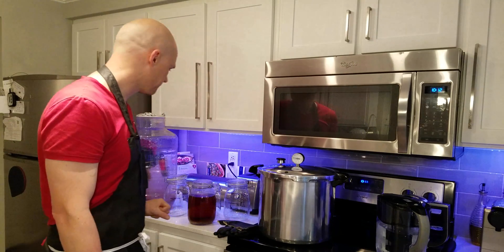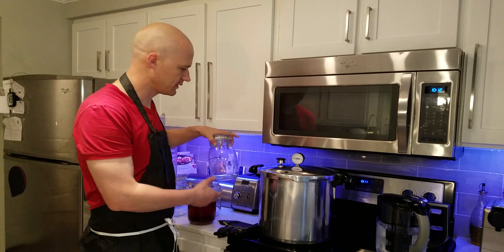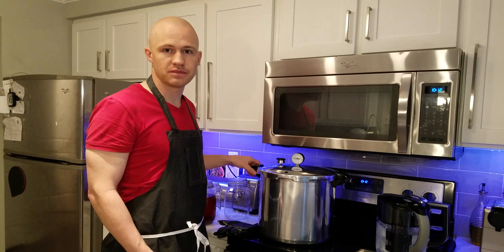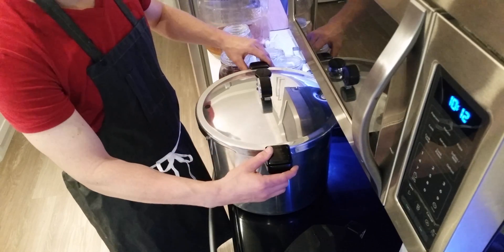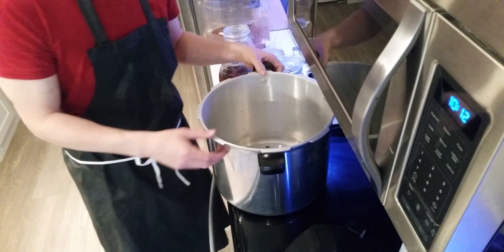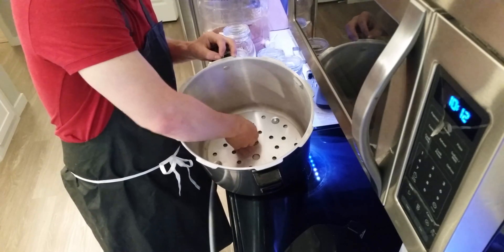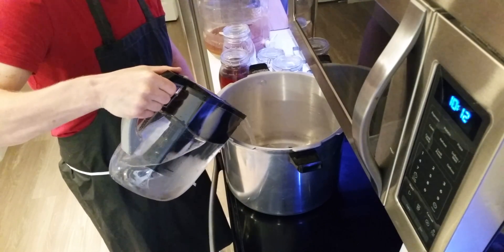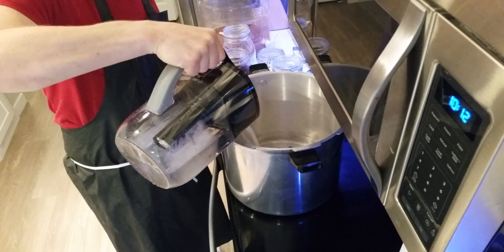First thing you need to do is have completely sterile glasses or containers. So what I'm going to do is put these glasses inside of a pressure cooker, cook them at 15 psi for 15 minutes, and that will sterilize the glasses. Inside here you'll see just this plate, and then we fill here with water. I'm using filtered water because I'm going to use this water later on to pour into the fermenter. That way we know we have completely sterile water as well.